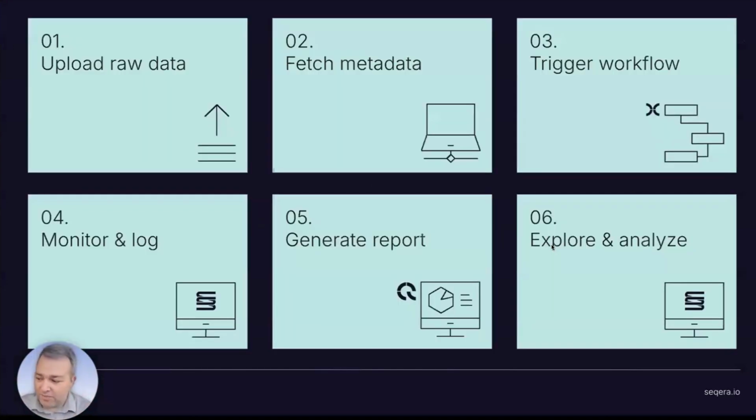So in terms of the overall solution that we covered, we did hit all six of these steps. Of course, our code itself will not be the end solution, but we wanted to put it together as a very simple example of how you can do an end-to-end automated process using the combination of these tools: Temporal, Seqera Platform, and Nextflow.